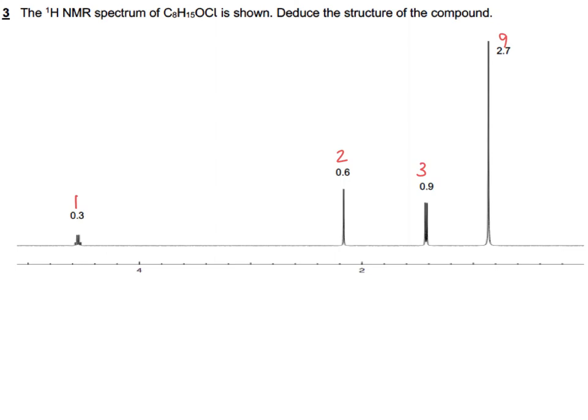If I look at the splitting pattern, I've got a quartet, I've got a singlet. Maybe that isn't so obvious, but it's a doublet. One way of judging that, if you remember what these integration values are supposed to be, is the area under the lines. The fact that we have more hydrogens in the one labelled 0.9 compared to 0.6, but it's not as tall, means that we must actually have more lines, because that makes up the difference in the area.